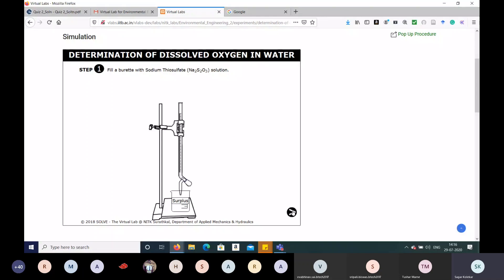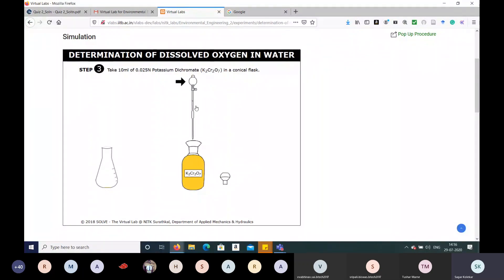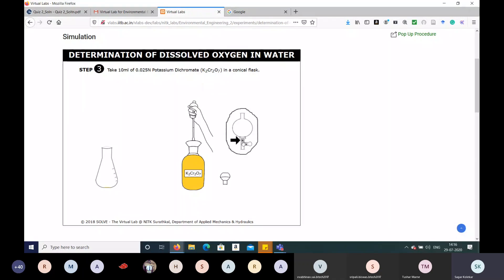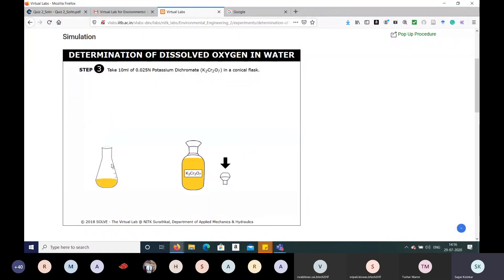The next step is to take 10 mL of 0.025 N potassium dichromate (K₂Cr₂O₇) in a conical flask. Remove the nozzle of the K₂Cr₂O₇ bottle and use the pipette to draw the solution — press the knob to fill and press again to release — dispensing exactly 10 mL of 0.025 N potassium dichromate.